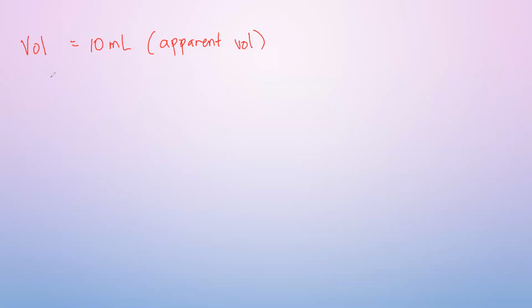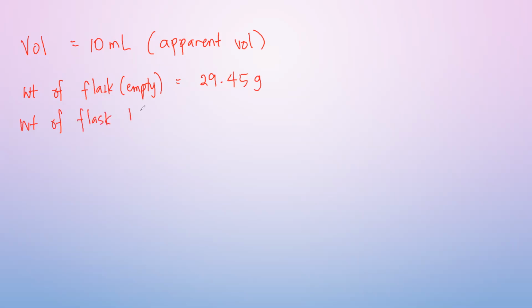For example, the weight of the empty flask is like 29.45 grams. And then the weight of the flask plus the water is like 39.15 grams. Okay, for example lang ha.